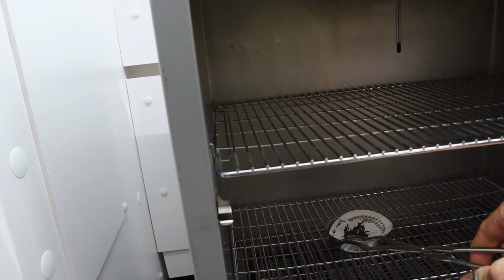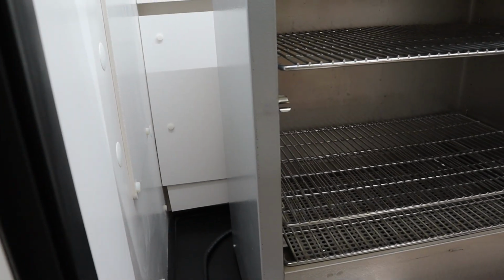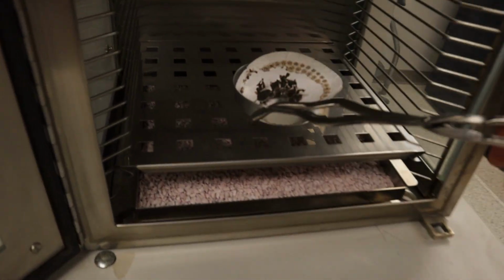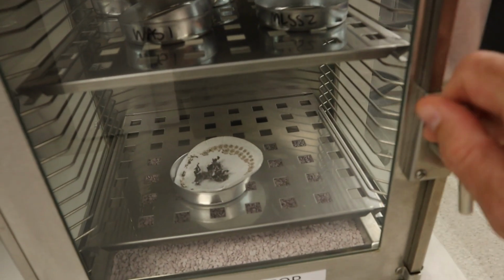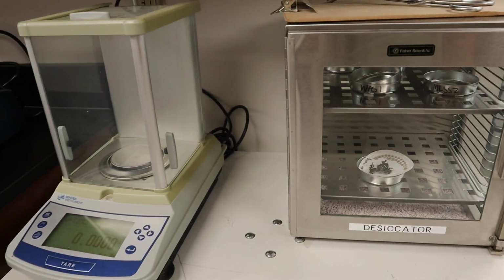Oh yeah, nice and dry, looking crispy. We're gonna set that down, close our oven, and we're gonna gently set it in our desiccator. Alright, we're gonna let that chill for about 15 minutes before we throw it on the balance there.